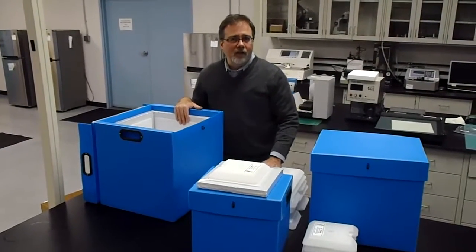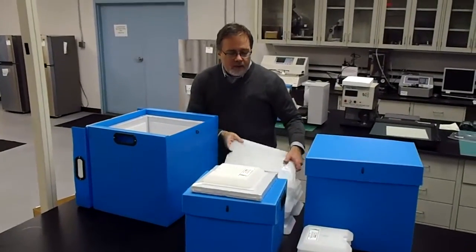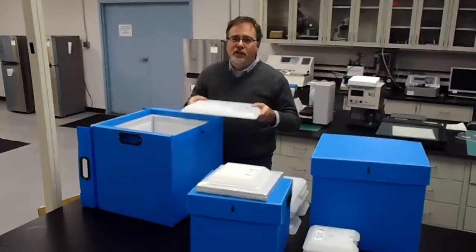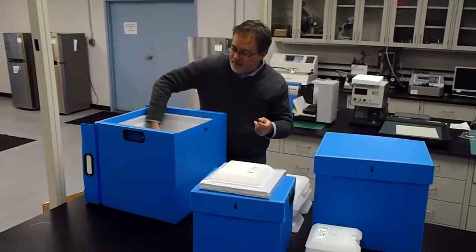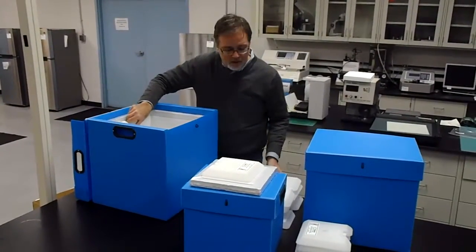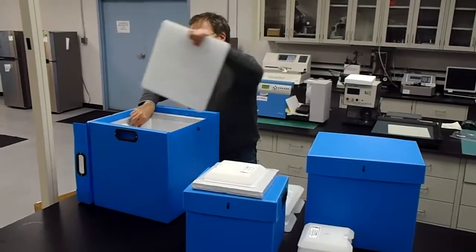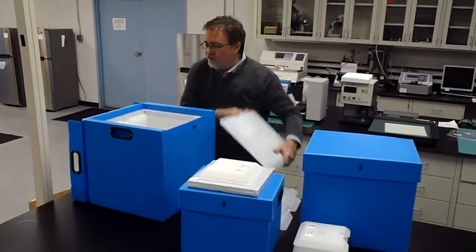Once the phase change panels have been pre-conditioned in a freezer, the panels are then placed inside the shipper as demonstrated here. First installed is the bottom plate. Then the side plates are installed afterwards, one at a time, along the interior sides of the container that you see here.